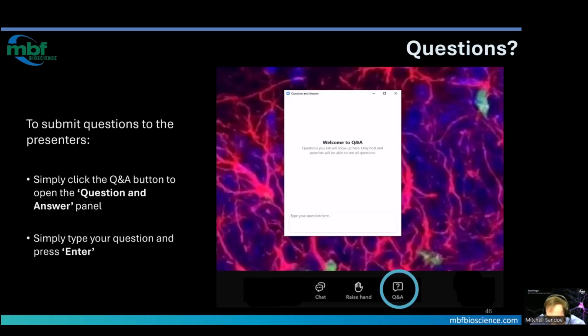But hopefully I'm interpreting this question right. Yeah, hypothetical, not incorporated into ScanImage.